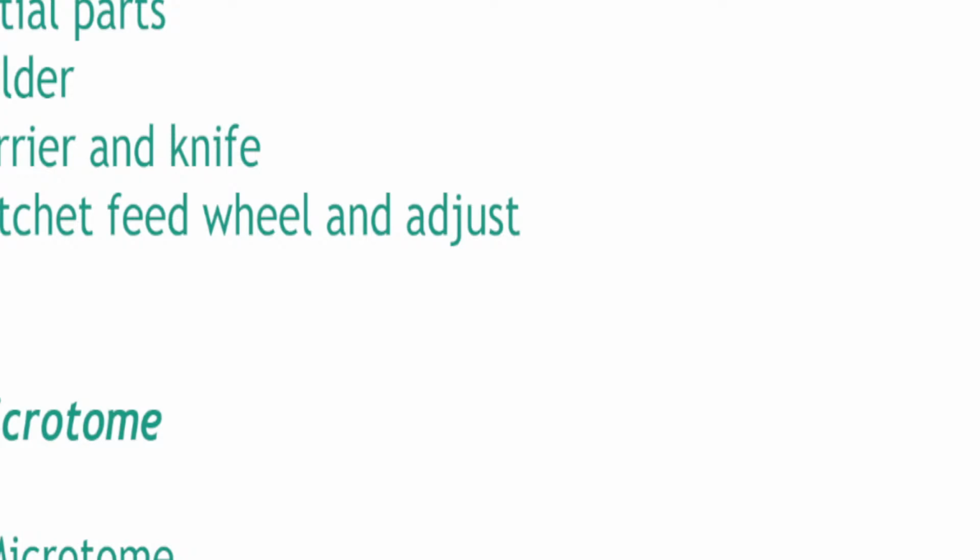The reason why I added this is because maybe they'll ask it on the board exam, but again, historically, I've not heard anybody say anything about the parts of the microtome. What I did get is the types of the microtome. I did get that historically from previous board examinations. They'll ask you questions about which of the following is the most dangerous type of microtome. So rocking microtome, basically what happens is that there is just a blade that goes down, up, down, up, down. Okay? Up, down, up, down. Nothing special about that. That's the most traditional.